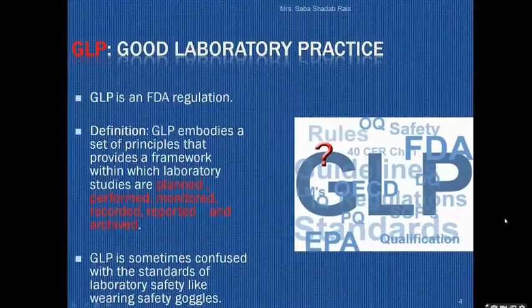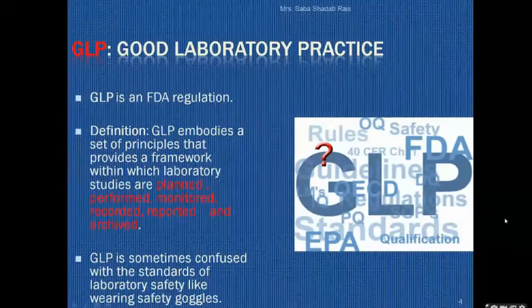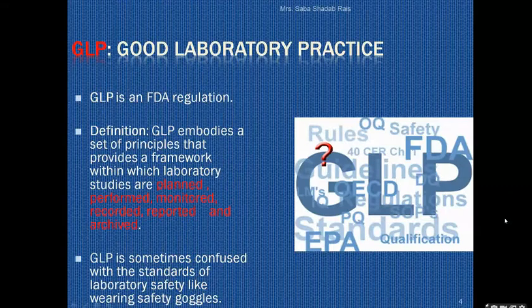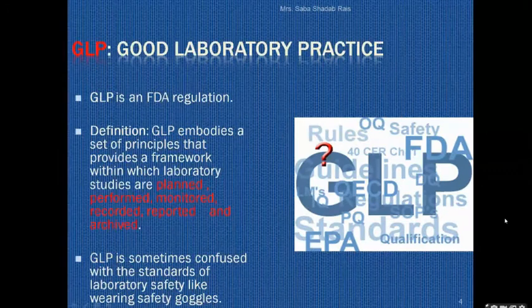or blueprint within which the laboratory studies are planned. Whatever we are going to study in the laboratory, whatever we are going to perform in the laboratory, as well as what we are going to monitor in the laboratory, reported and archived, and maintain the proper records of the laboratory.